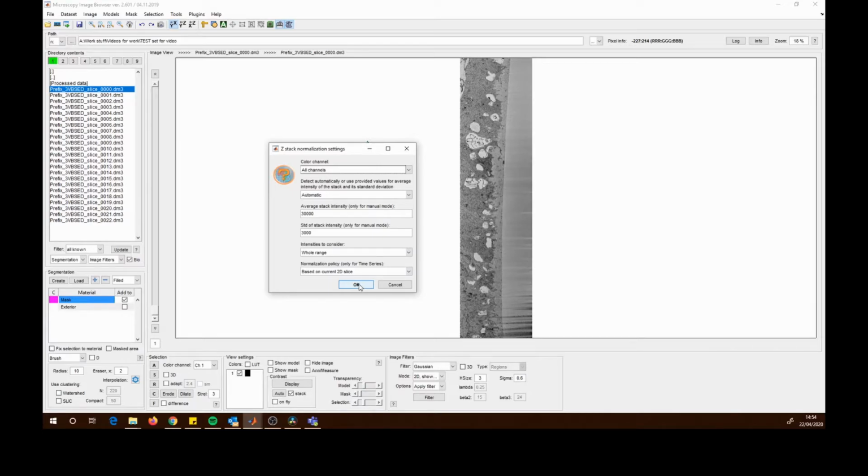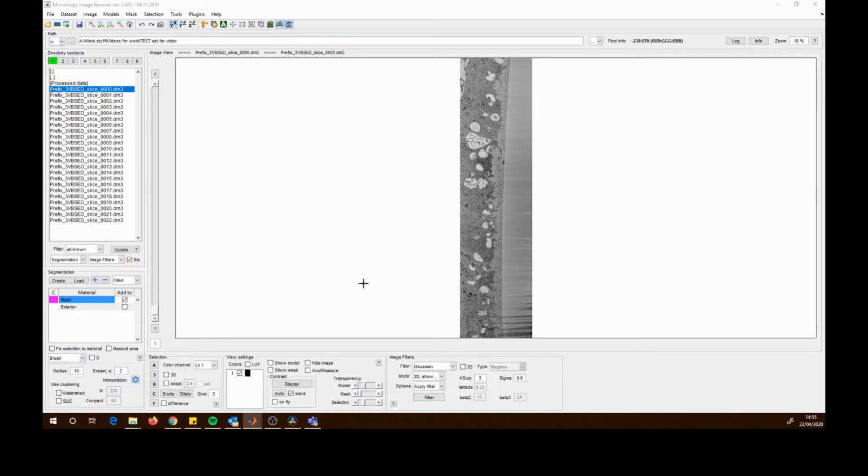For more detailed tutorials on how to use individual tools and features like this, I will make some other videos. So I'm going to run that.